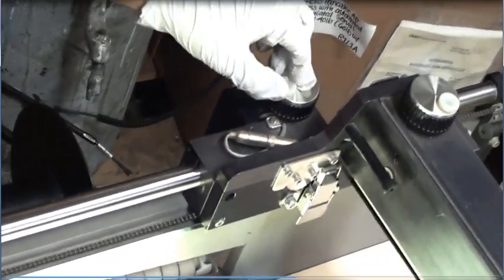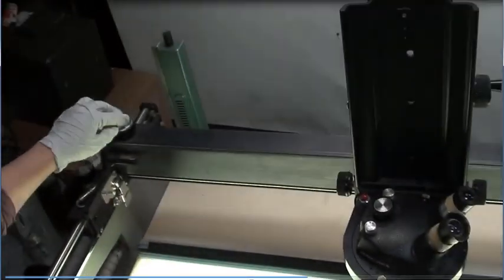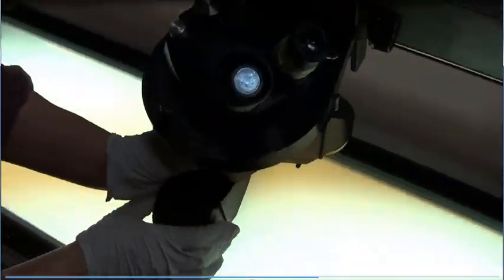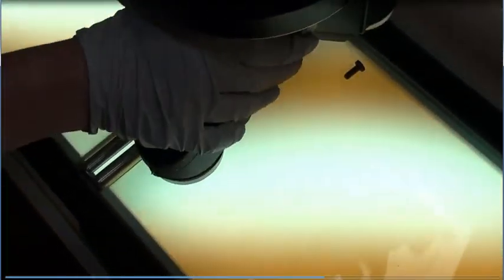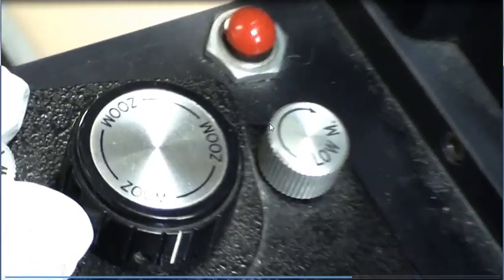Another control that you do have, I'm going to take you over here. You can also adjust the position of your microscope, either lengthwise or you can also center it. Another feature of the microscope itself is that you have these swivel heads that can go in any direction. We have two screws on the table to kind of show you that you can compare two items. You also have the feature of zooming in and focusing with these levers on the top of the microscope.